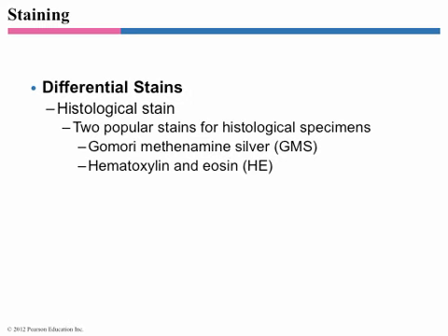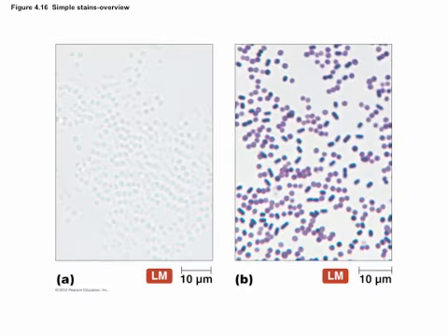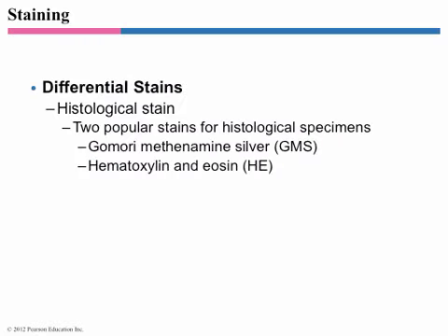You have a question? These specific stains, are we going to need to remember these? Not those ones. This is the one. This is a Gram stain. So these are to remind me if I wanted to talk about it. If you're staining, so histology stains, this is if you're looking at human cells in thin section, usually that have been embedded in wax, which I said you might do sometimes. GMS and HE are the two most common stains, differential stains to look at human cells with.